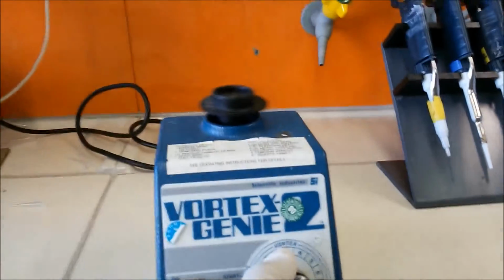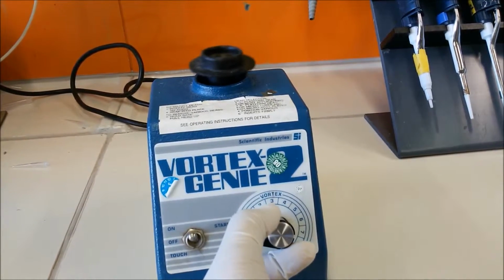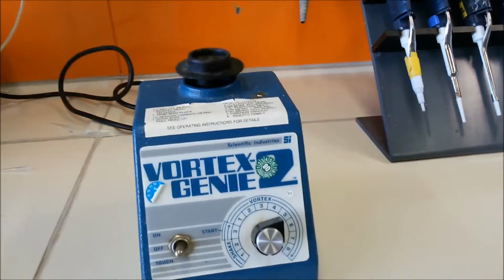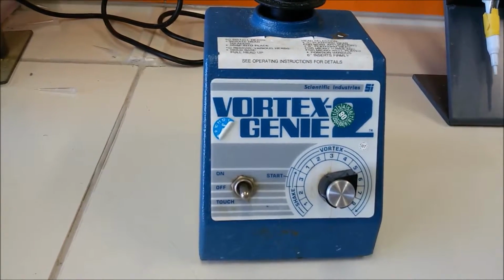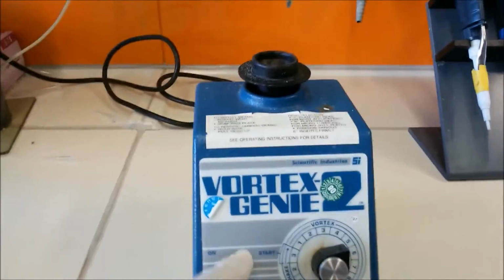So let's take it. See, you can see it's moving very slow. We can regulate it. Now it's moving very slow. We can make it faster if we want. Let's switch it off. There is another feature, and we use this machine to mix anything in a small tube that we want to quickly mix. So we can switch it on again.